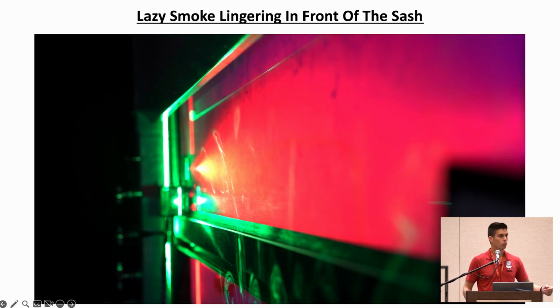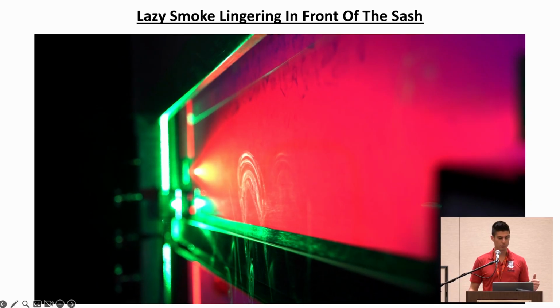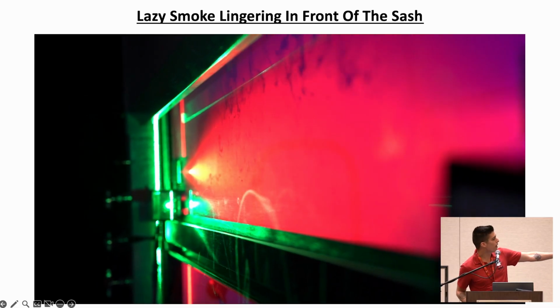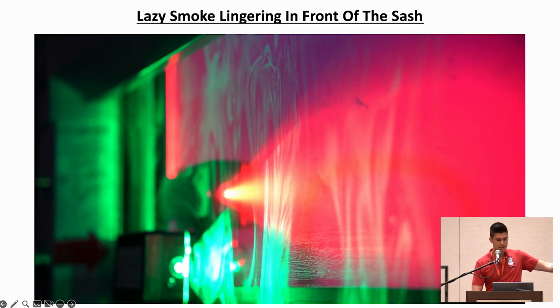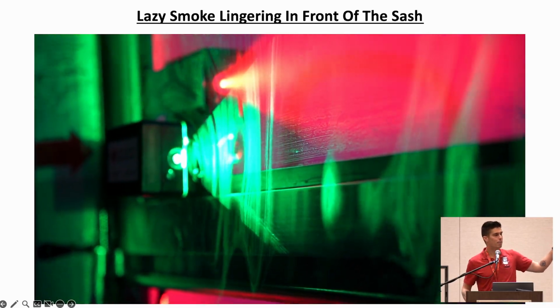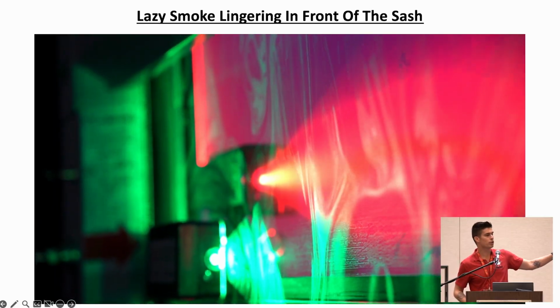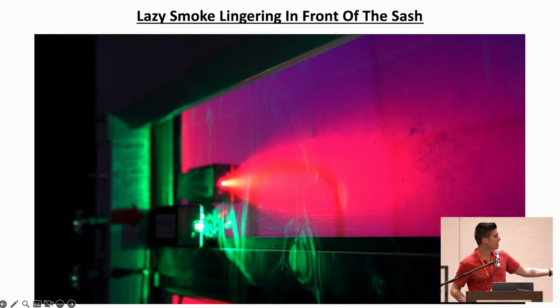Again, visual. We have to release the smoke in there in the right way, and then we need to see what it's doing with the fume hood. This example right here is very interesting because a lot of people don't see this. It's only something that you can see with lasers, which is why I put it in here, because it shows you the unique thing. You couldn't have seen this with just regular smoke. It requires that laser being on the outside of the sash.